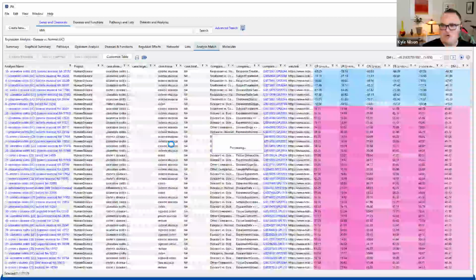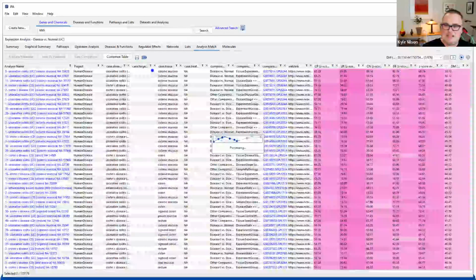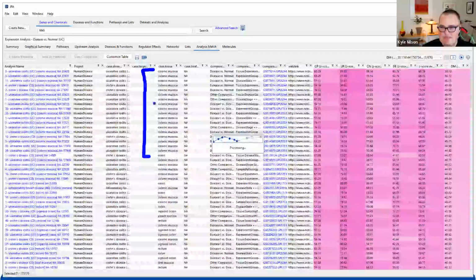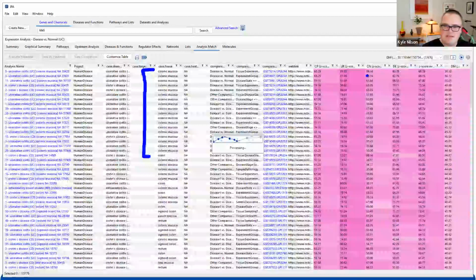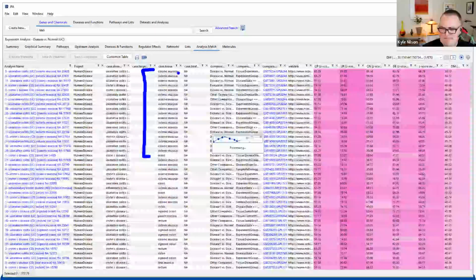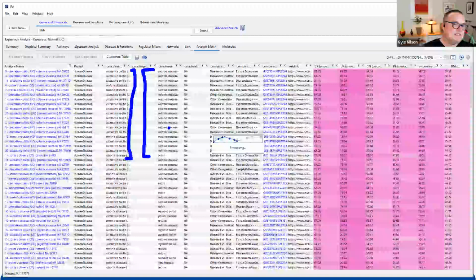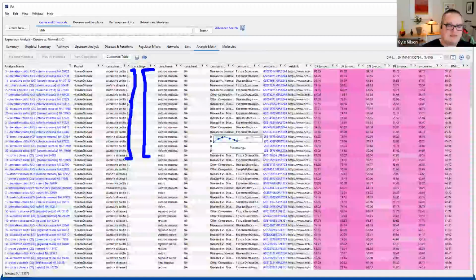And when we sort by that method, it turns out that that is a surprisingly useful way to find similar samples from the exact same tissue. So here, pretty much all of these top results are from the exact same tissue, the same colonic mucosa. And in addition, pretty much all of the top results, with the exception of 1 or 2 Crohn's disease samples, are enriched for ulcerative colitis.